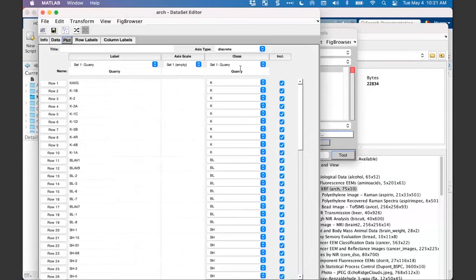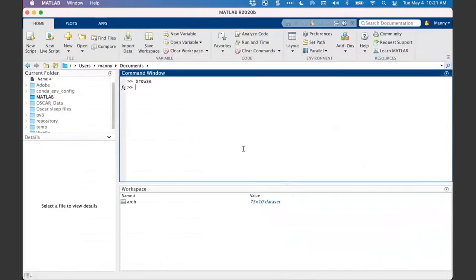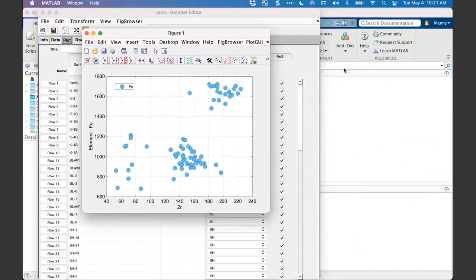And here is the first class set that we were seeing before. So if you have a list of your samples in Excel, you can basically copy and paste here. You will just make a new set and then copy in Excel and paste here. The other way to do it is graphically, and it's very convenient.